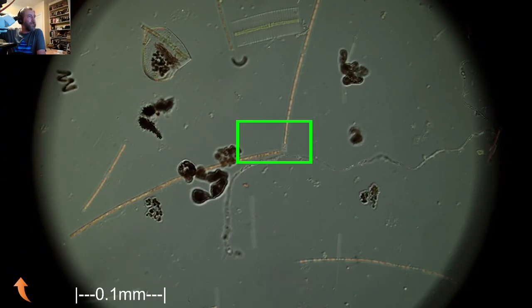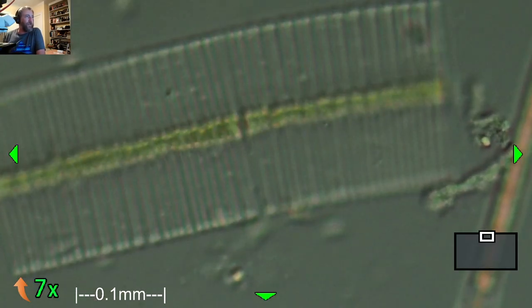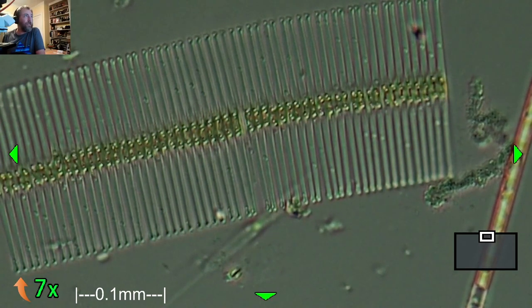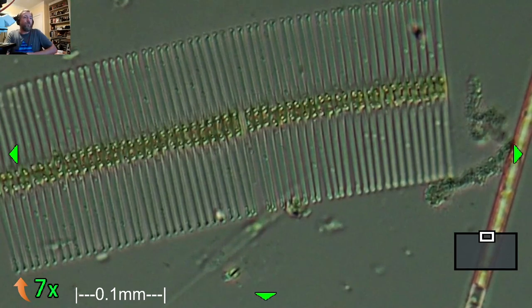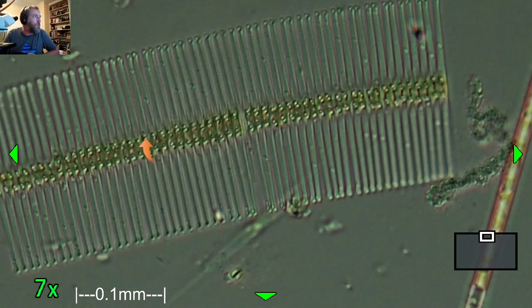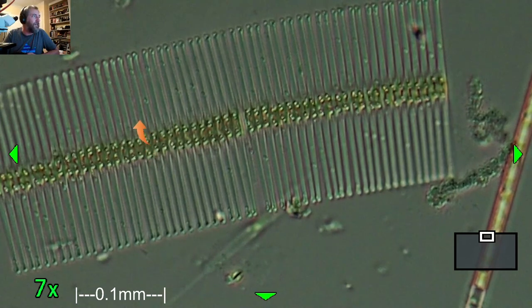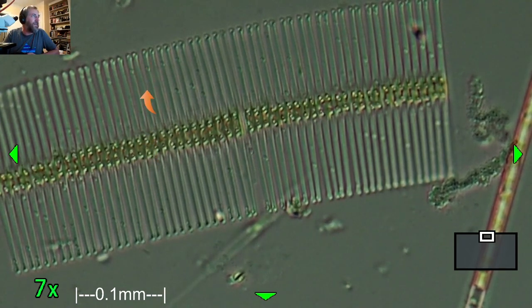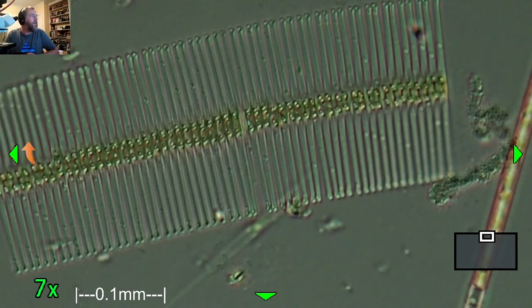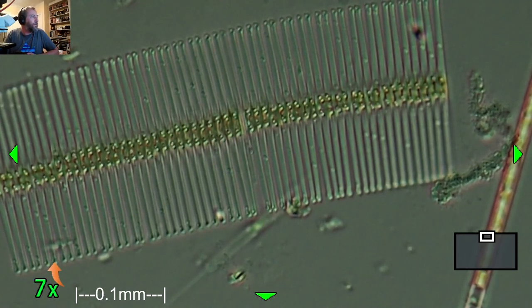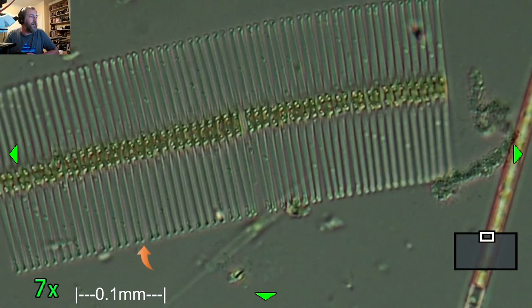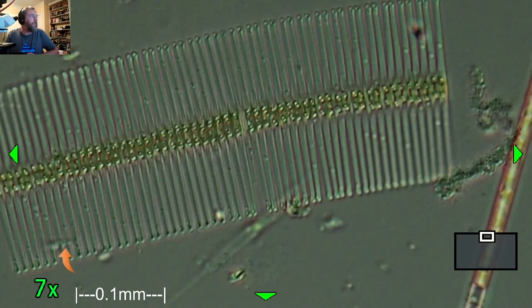Let's see. Oops. I keep pushing the wrong button. This one. Those are diatoms. That is a colony of Fragillaria crotonensis. And each one of these little pieces right here, each one of these, is a diatom valve. Or cell. A whole cell. And they're living in attached colonies that look like a blade or something like that. All lined up. Or like a ladder. Or a vertebra. Or like a rib cage. But each one of those is a whole diatom. And they're living in these long colonies.